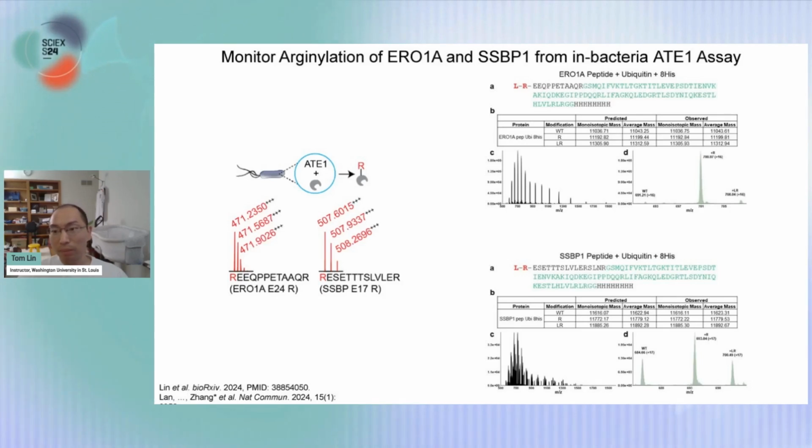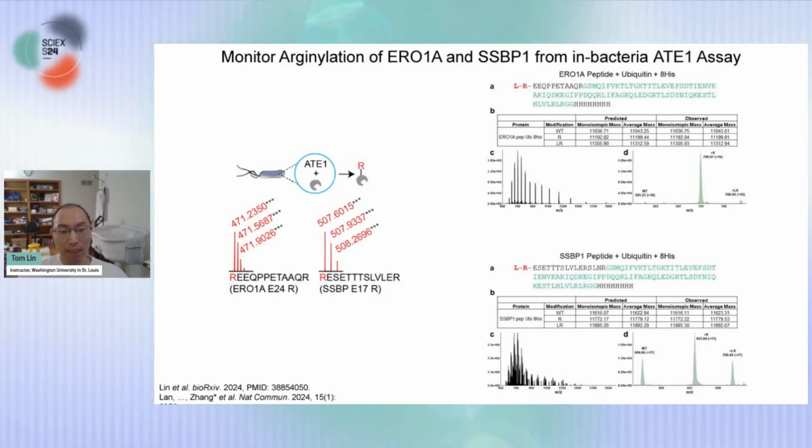One is the unmodified species on the left side, marked as wild type. And you can also see a 3rd species, which is bacteria specific. So this is a leucylated and arginylated species, as shown in the sequence, a unique product produced by the bacteria enzyme called LFTR, leucyl phenylalanyl transferase.